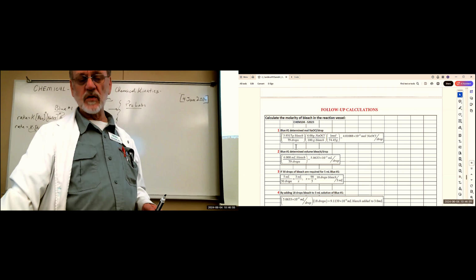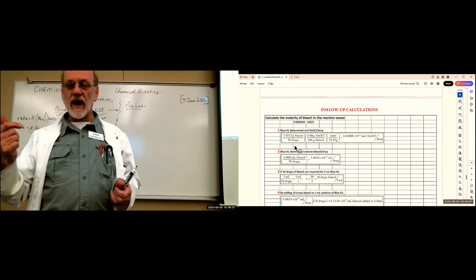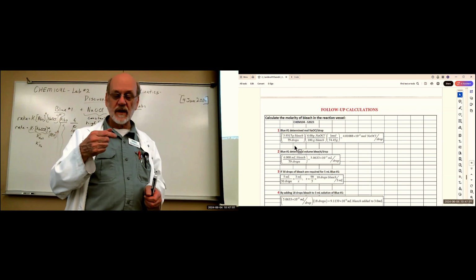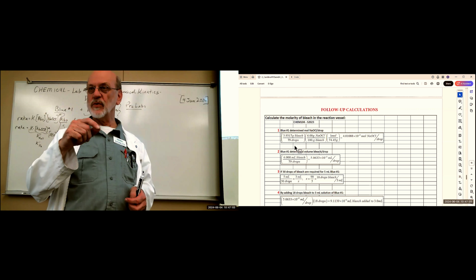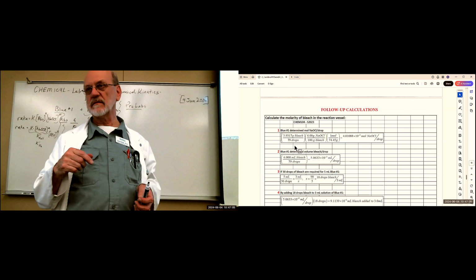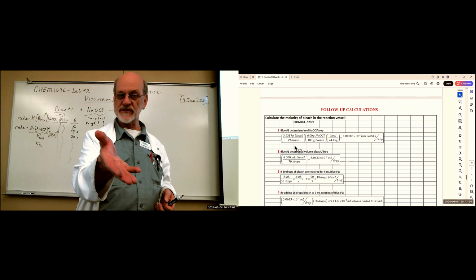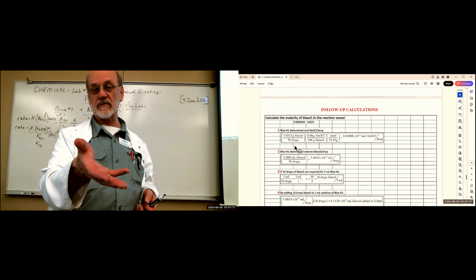All right. So you're gonna take that dropper. You can do this after the experiment. Take that same dropper and go to the balance and put so many drops in there. You know, more drops is probably better. So in this case, our example of 79 drops gives you 3.9 grams.